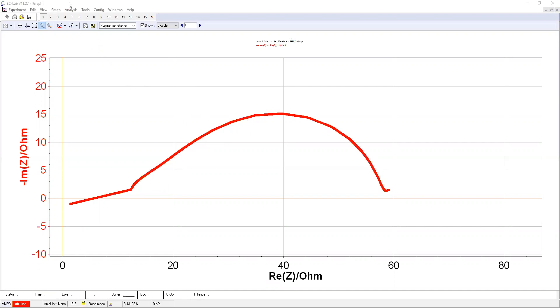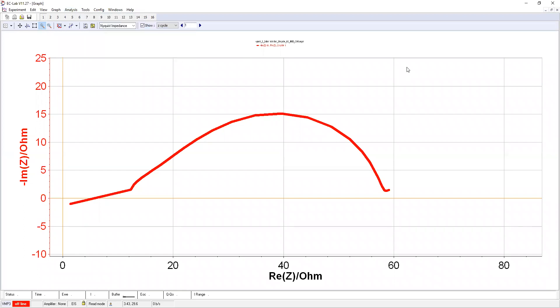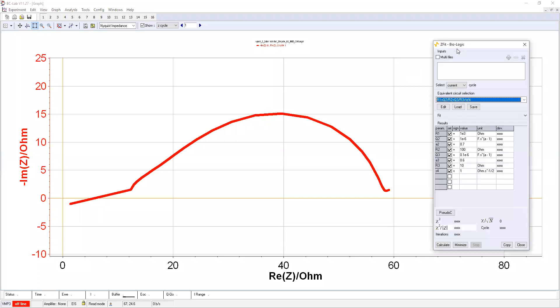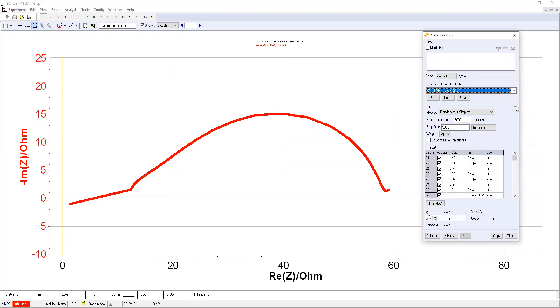First you go to the Analysis, then Electrochemical Impedance Spectroscopy, and then ZFit. When you get this window, you need to fix up something like the fitting parameters. First is the method, which method you want to use.